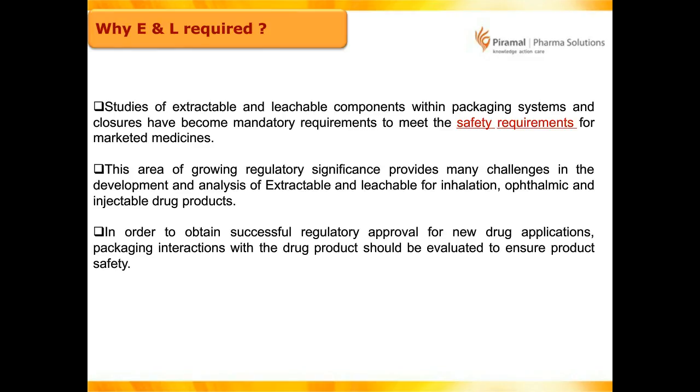Also, this area is growing very significantly, where the regulatory team is facing challenges for different dosage forms. These dosage forms are inhalation, ophthalmic, and injectable drug products, where extractable leachable study is becoming mandatory. In order to obtain successful regulatory approval for any new drug application, packaging interaction with the drug product should be evaluated to ensure product safety. To have a foolproof drug product in the US or Europe market, extractable leachable plays a vital role, a vital study to be part of your submission document. That's the reason why the extractable leachable study is required, and nowadays it is mandatory for the drug product which we need to file in these markets.